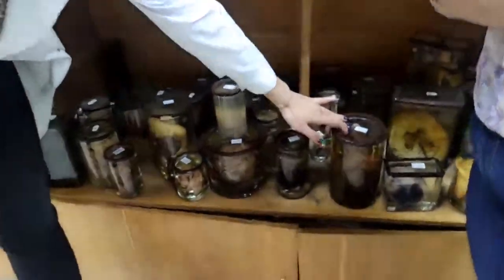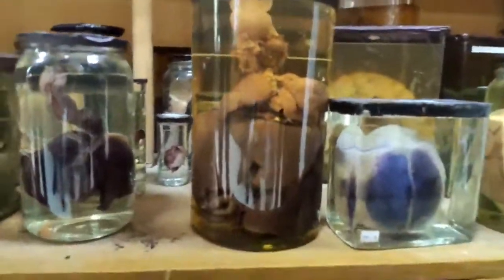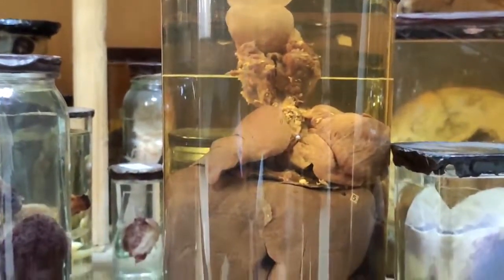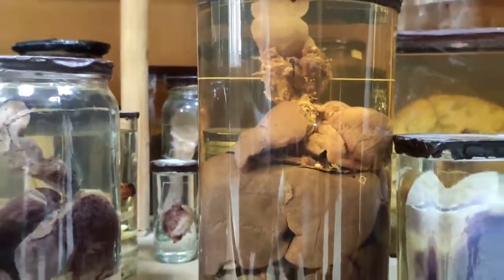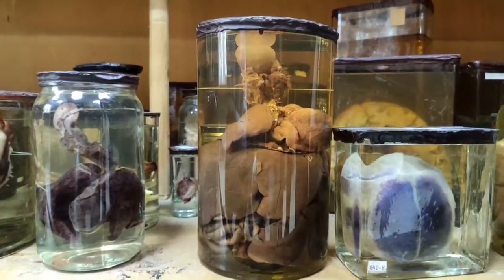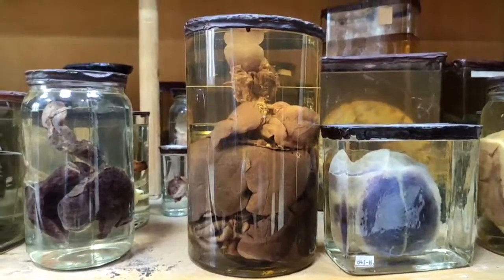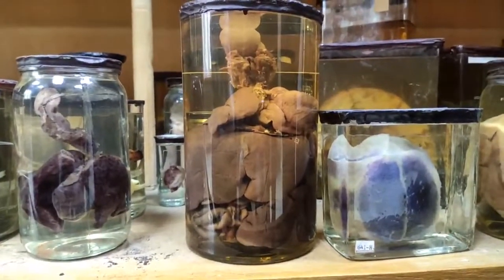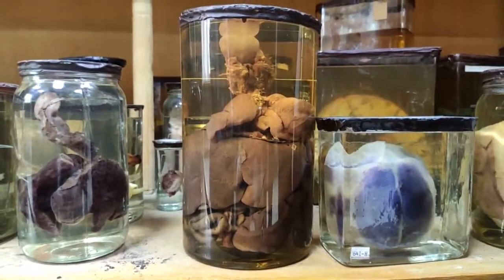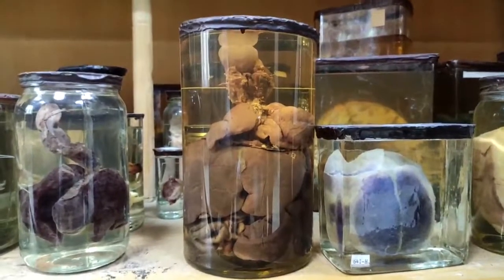The next one is hemolytic disease of the newborn. This patient also has jaundice because you can see a yellowish shade of these organs. And which organs are increased? Can you see? Yes, liver and spleen. So this child has hepatosplenomegaly, and you should know the cause of this disease.